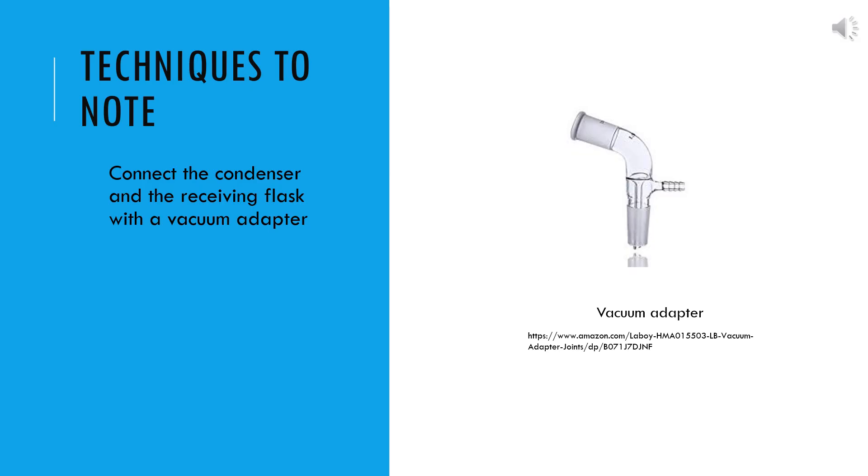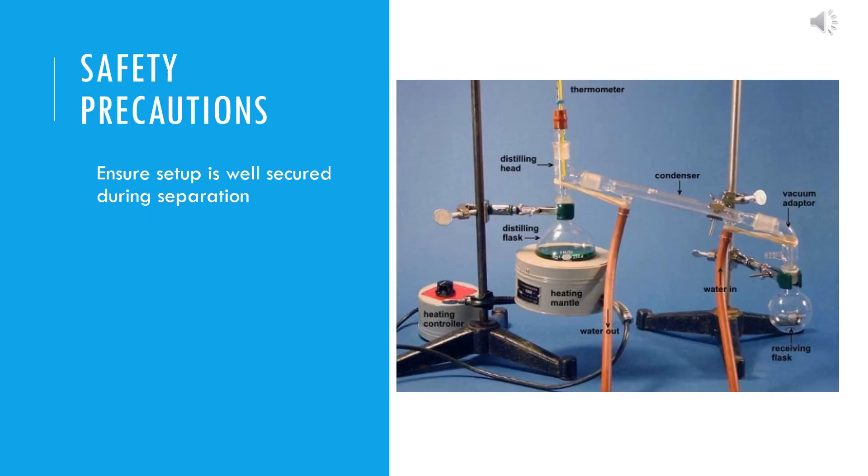A vacuum adapter is used as a connector between the condenser and the receiving flask. As a safety precaution, ensure all apparatus in the setup is firmly secured.